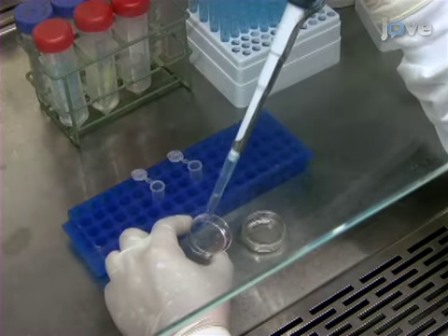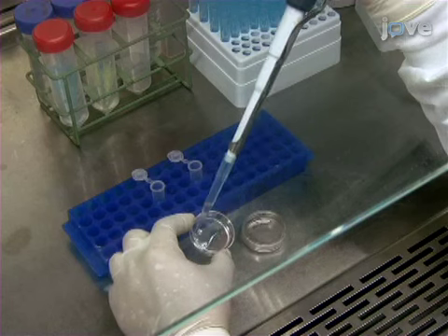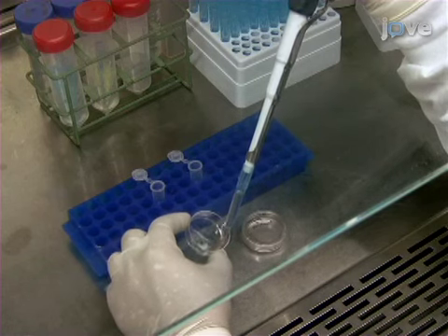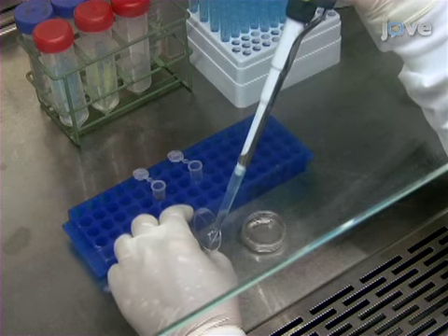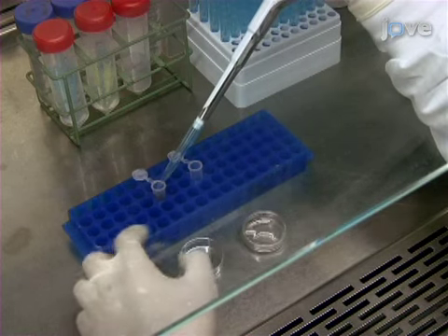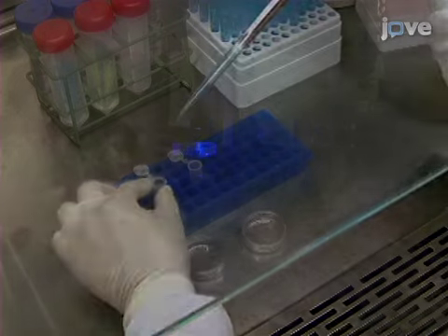After transfecting Jurkat cells with Nef-GFP plasmid and different variations of the SMR peptide using the Chariot protein delivery reagent kit, as described in the accompanying document, harvest the medium. To determine transfection efficiency by fluorescent microscopy, capture fluorescent and bright field images, and determine the percentage of cells transfected.